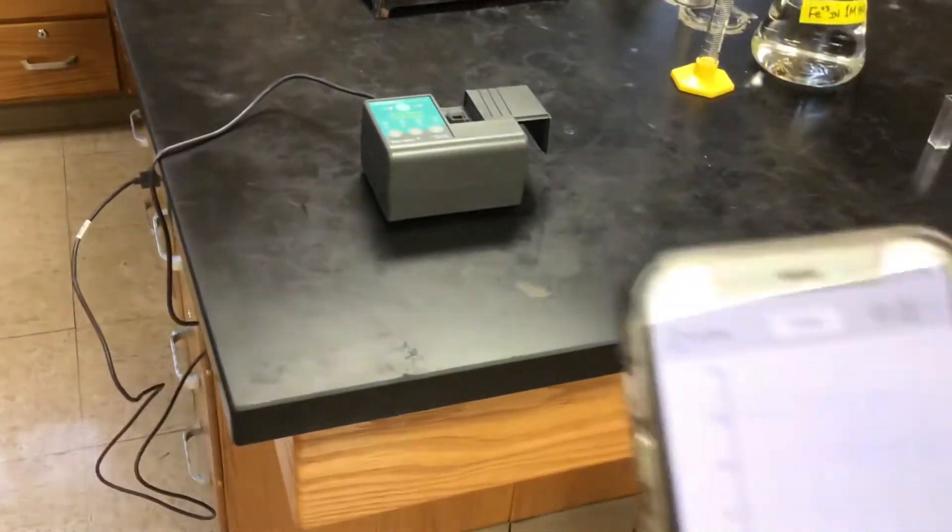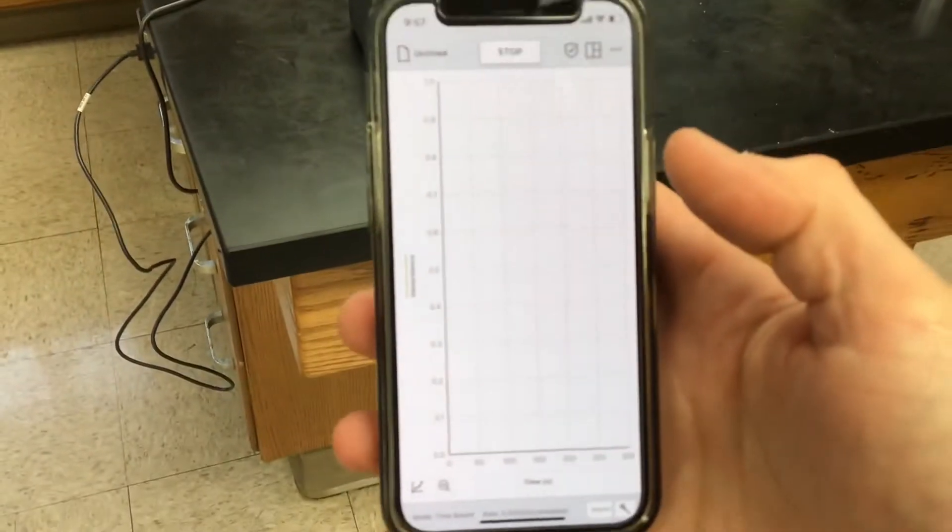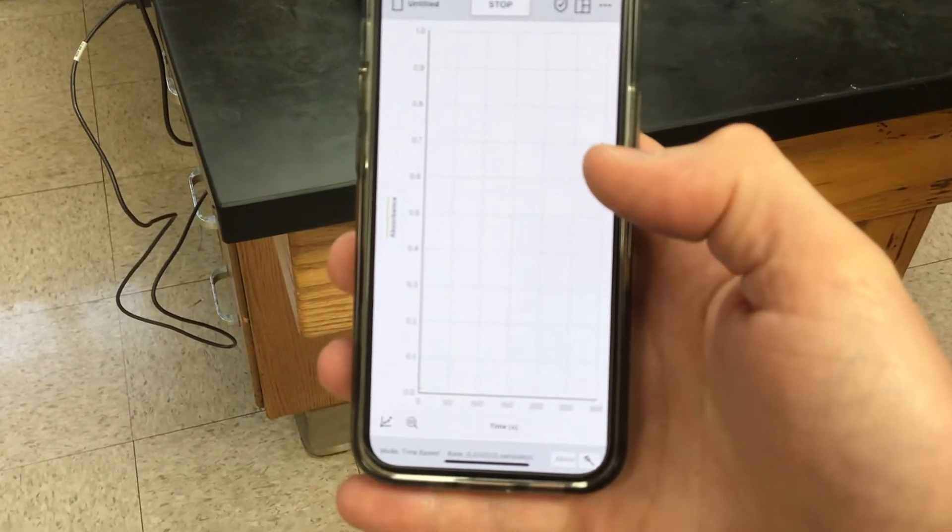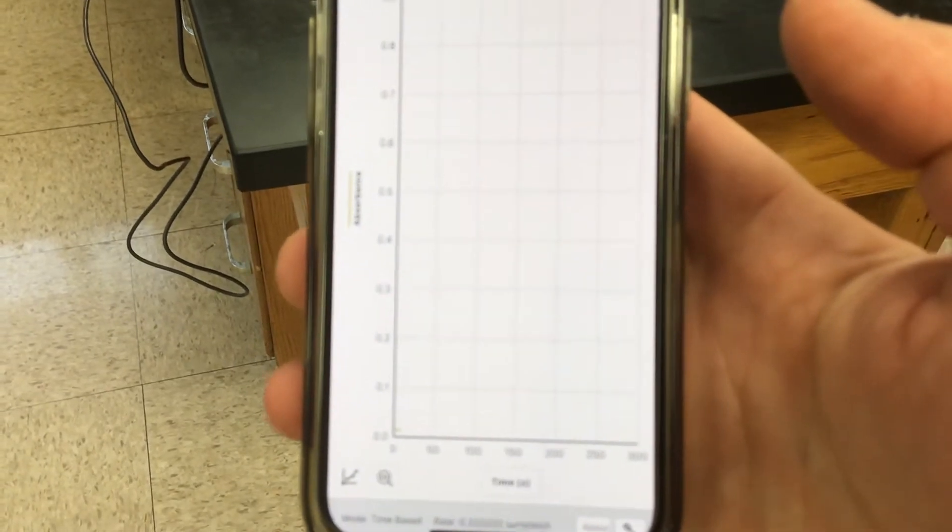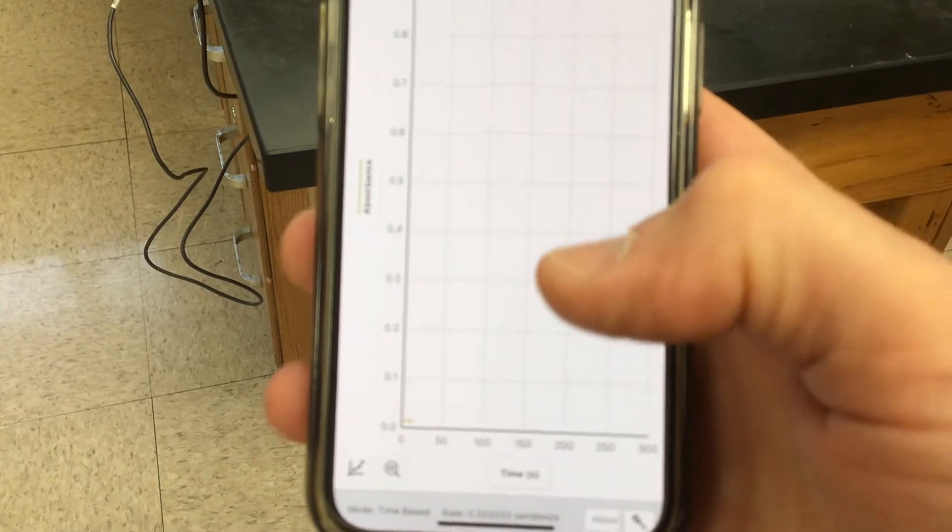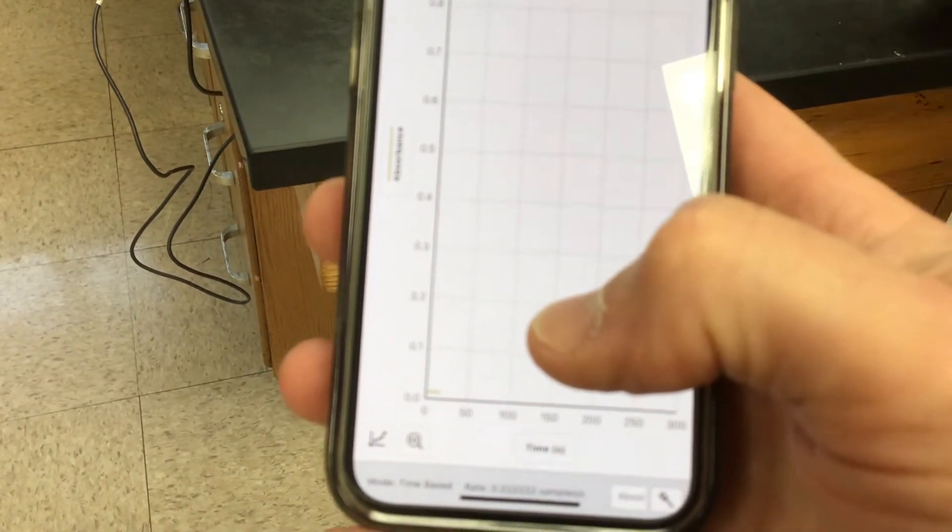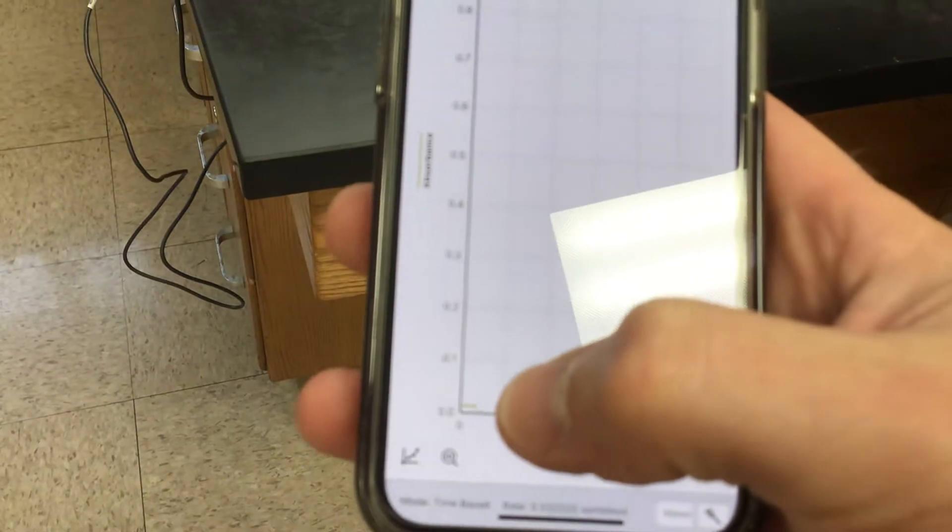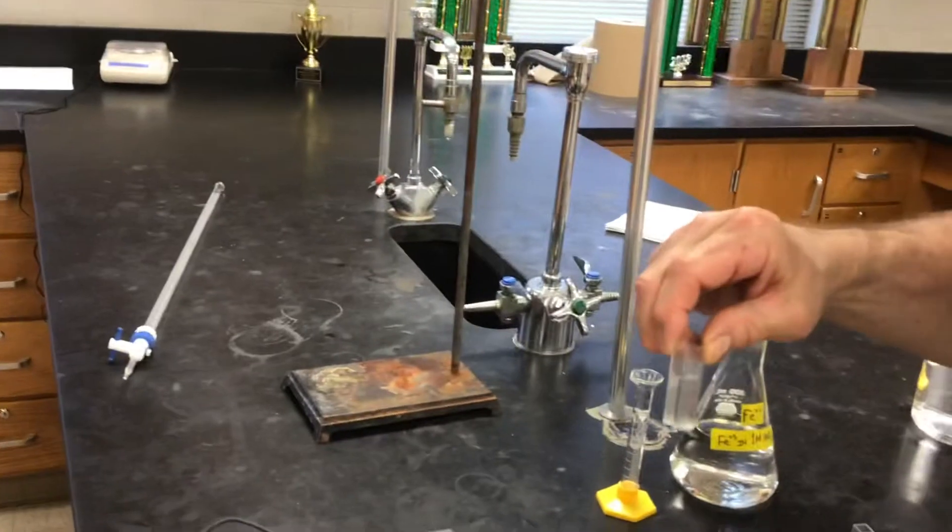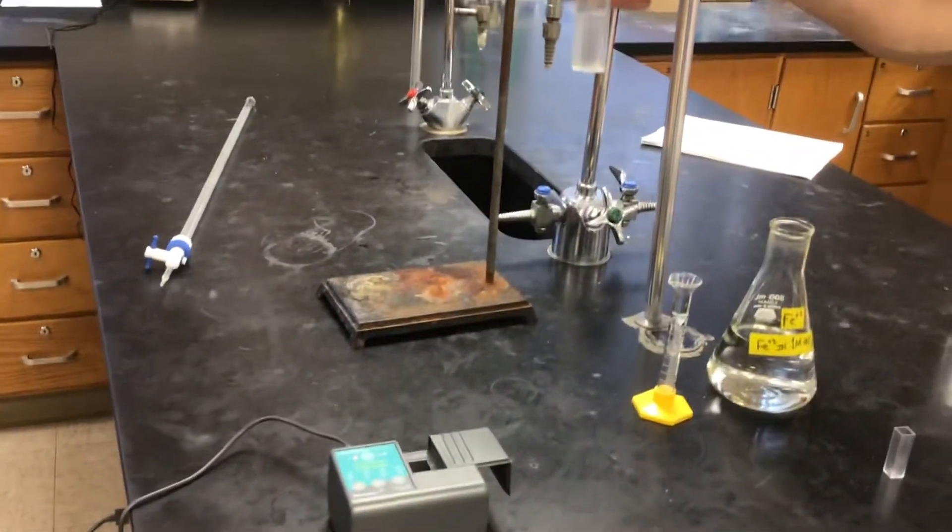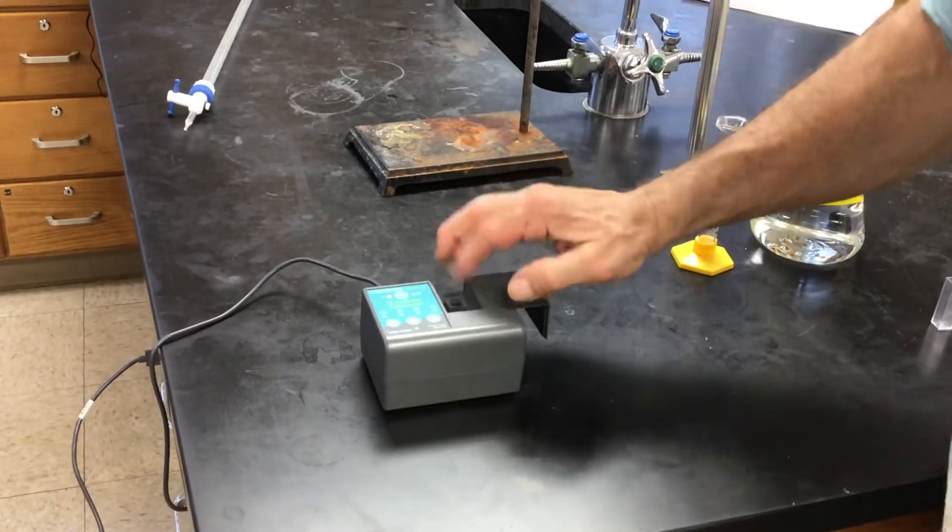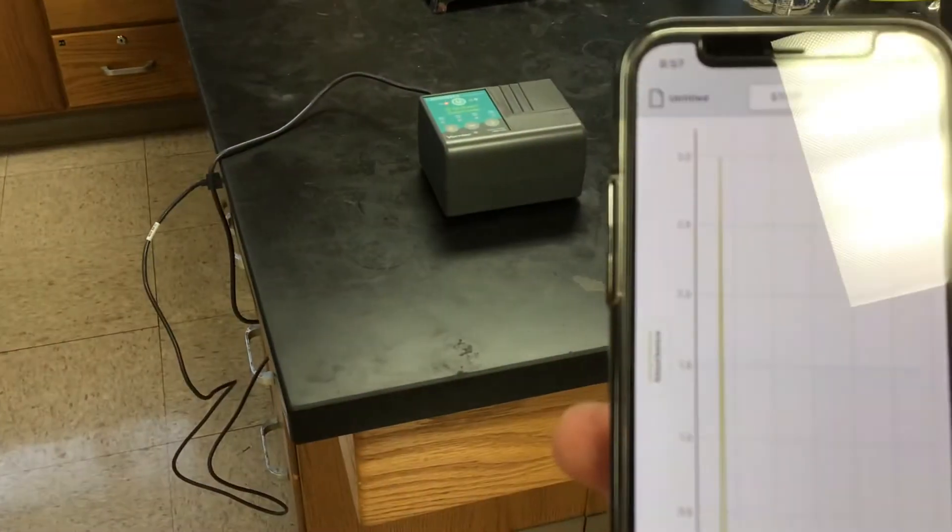If I'm collecting the data here, you can't see anything right now because it's not focused. Oh, looks like maybe we have to tell it to set a blank again. So here's the blank. It's just the DI water in the cuvette. So we'll drop it in and we'll close the door. And press the cal there in the middle.